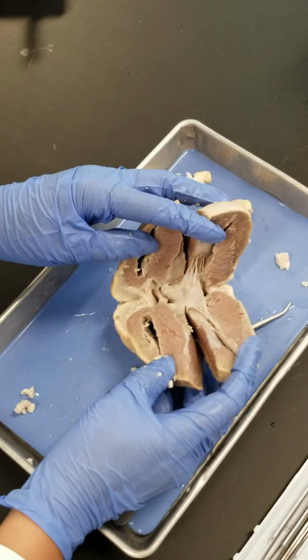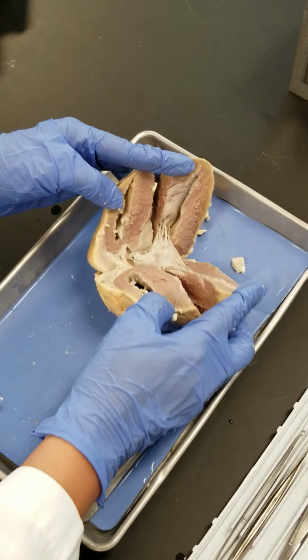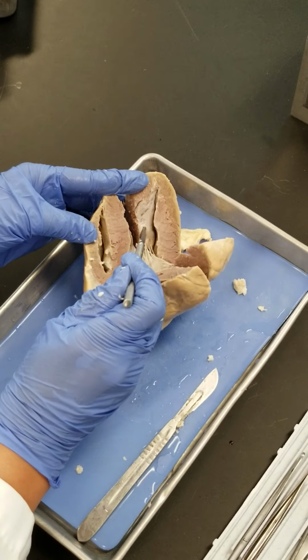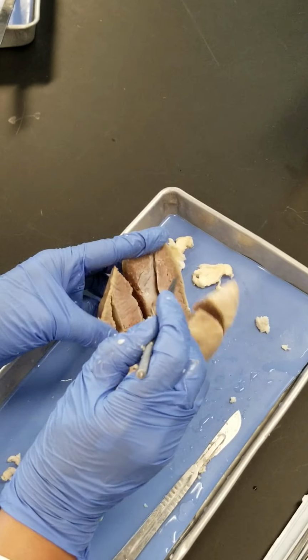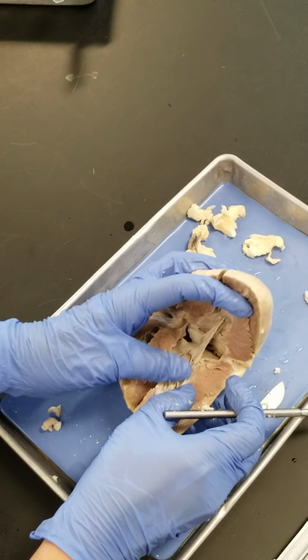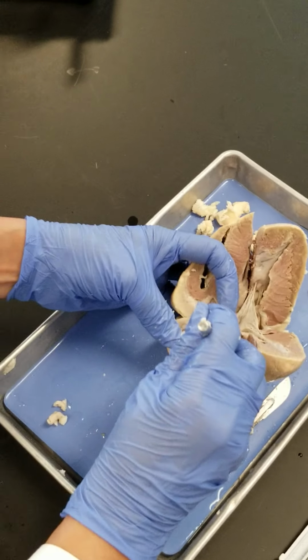It's actually very good. Can you take a picture of that? You see that? You see the valve? You see the tendon-like structures that are connected to that. What do we call them? Chordae tendineae. You see the muscles that these chordae tendineae are attached to. What do we call that muscle? Papillary muscles, right? You can see more papillary muscles on this side that have been cut here, but on some of your cuts, I'm sure that you got a good example of papillary muscles.